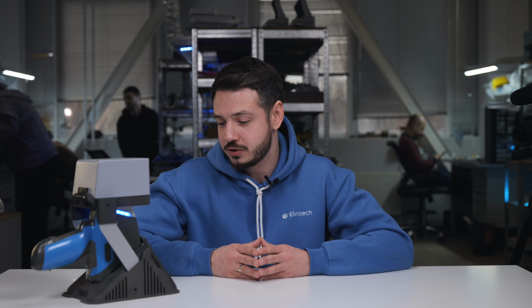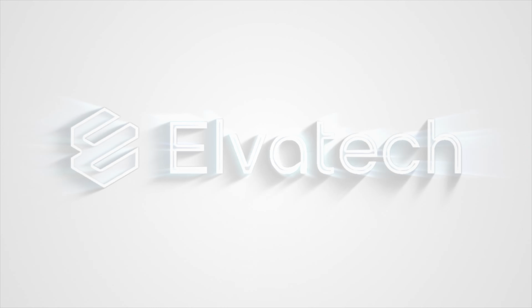So, summarizing, looking at this sample, we can say that the quantity of mentioned elements in it, and some of them are getting up to a strange amount, like lead. Basically, we can say that here we can have a technical contamination. So it's not of a natural origin, but of some industrial pollution and all that stuff. So this kind of sample from this soil, it's better to be checked again, and it's better to be cleaned up.